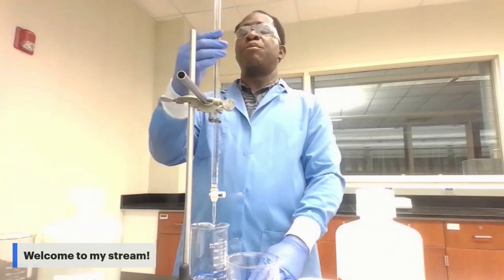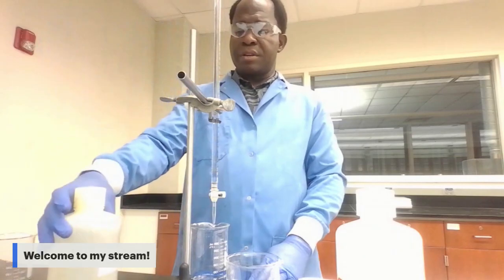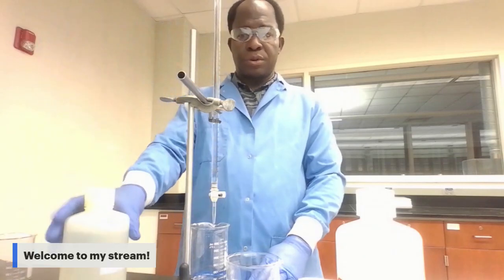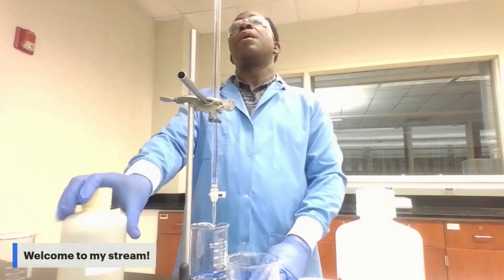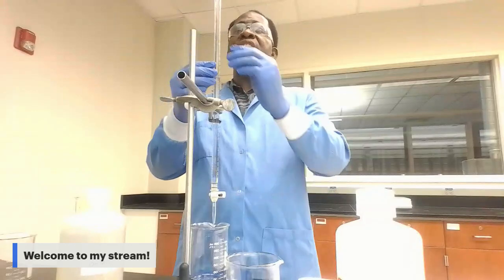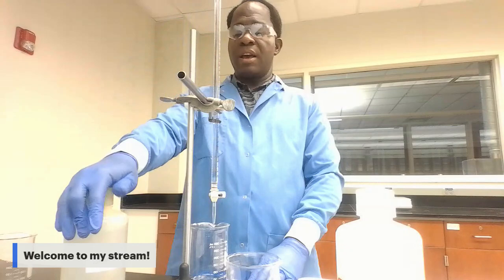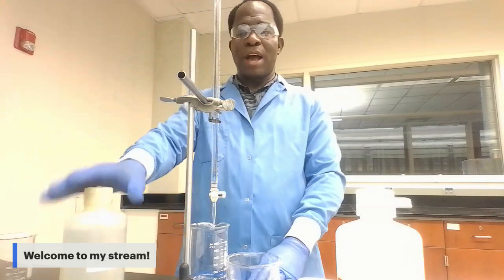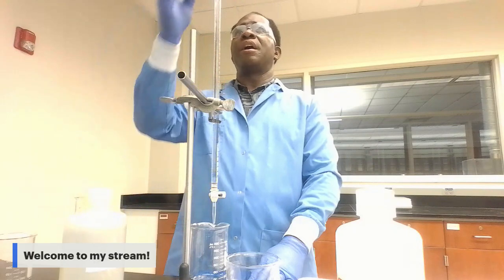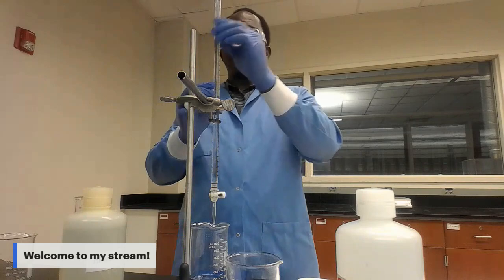Now, preparation of the burette. I'm going to use HCl to titrate the Ca(OH)2 solution, so I have to make sure I fill up the burette. You need to fill up the burette with 50 milliliters of HCl. Before I started this video, I already did this part. I have my burette filled to 0.